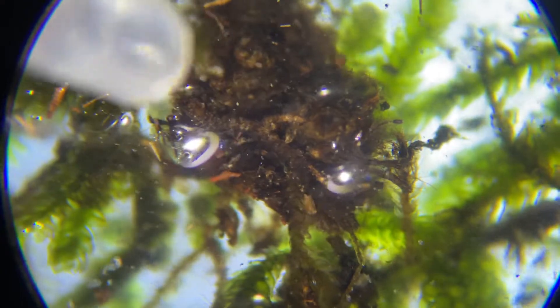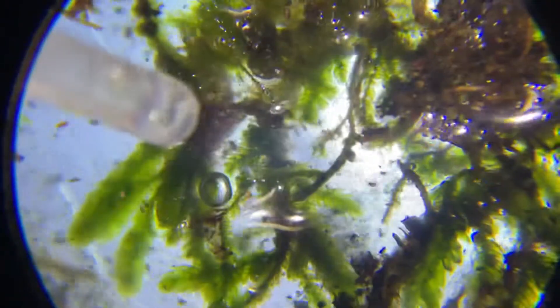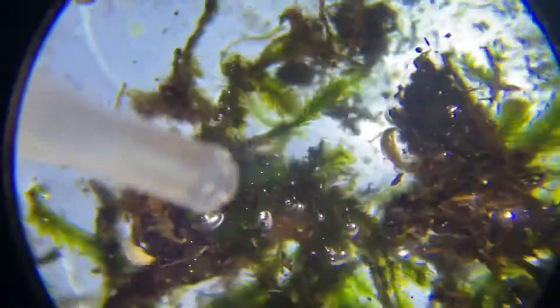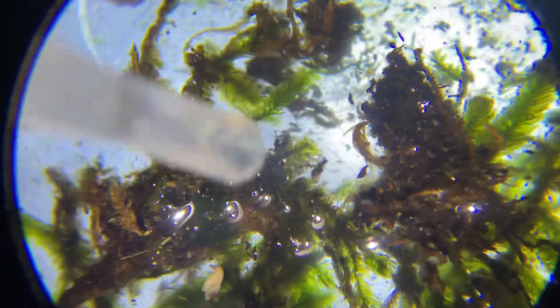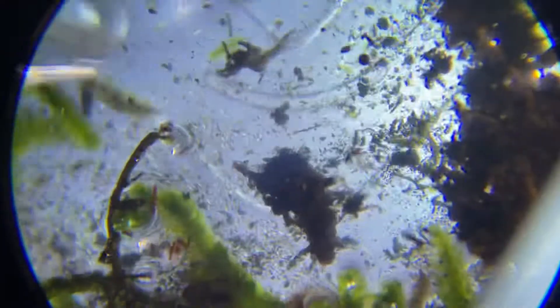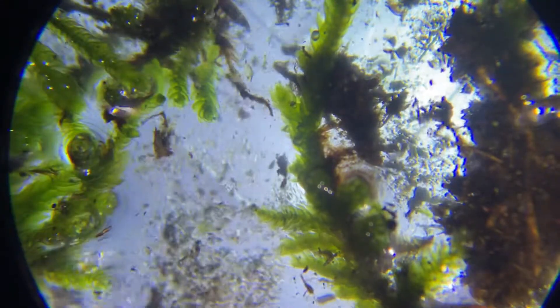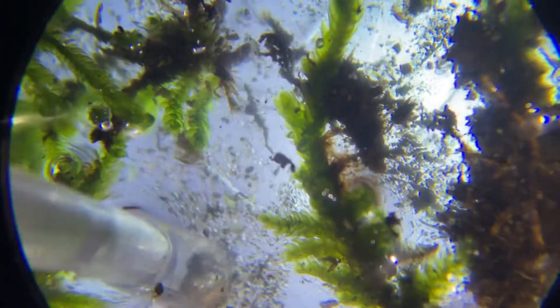The trouble with this magnification is you can't search around too much. You want a decent magnification so you can see them, but you also don't want to spend six hours looking at one sample, so you need some space. I still don't see any here. If anybody has any ideas how to do this better, let me know. Basically what you're doing is just looking for any motion.